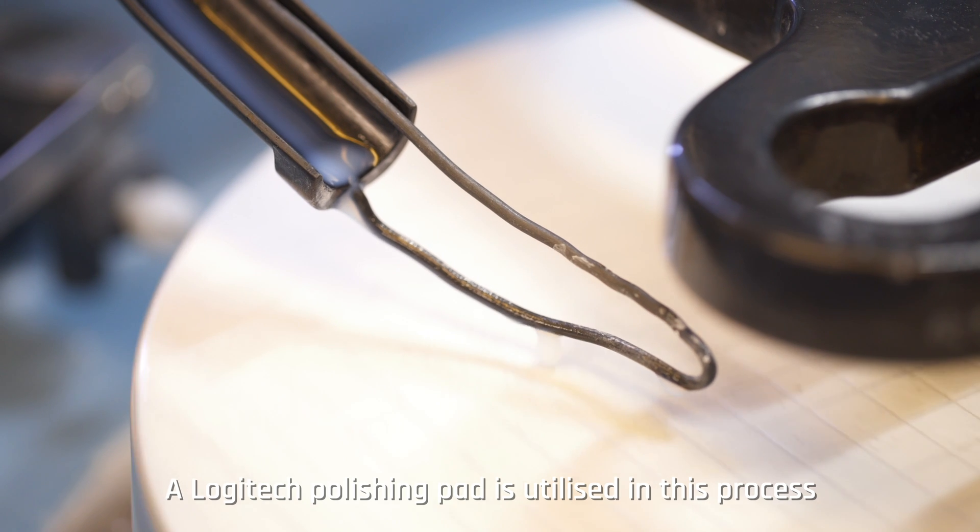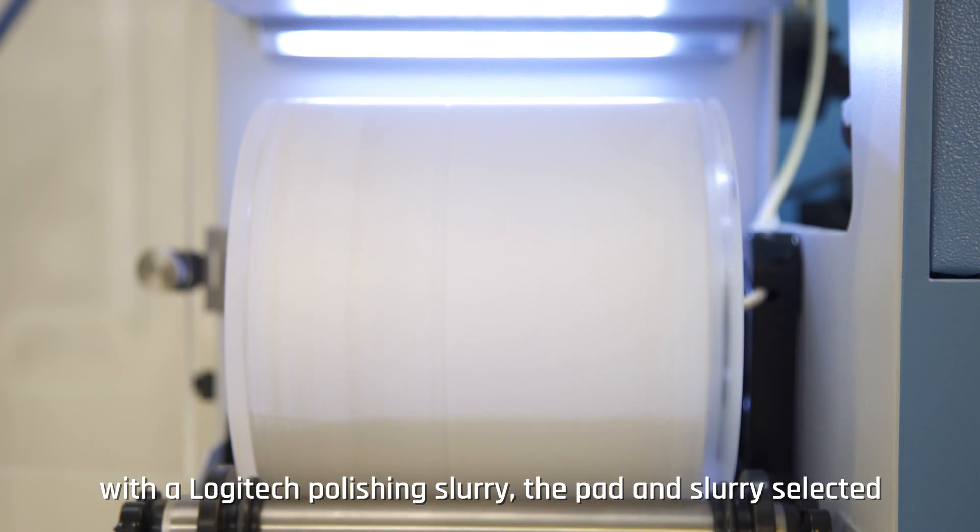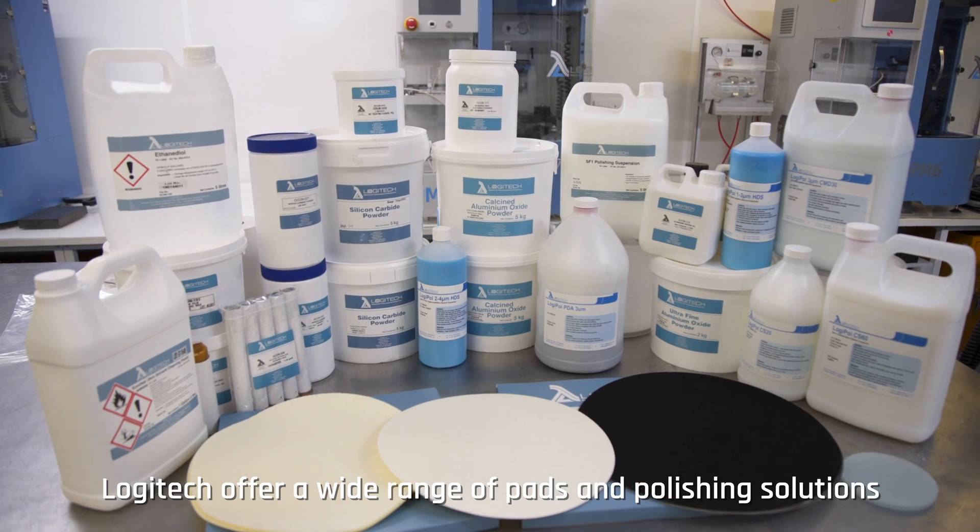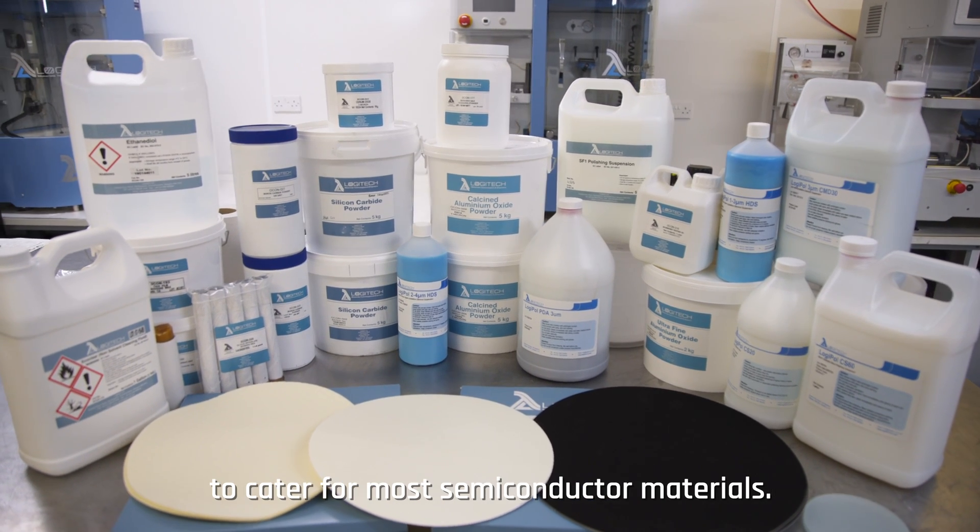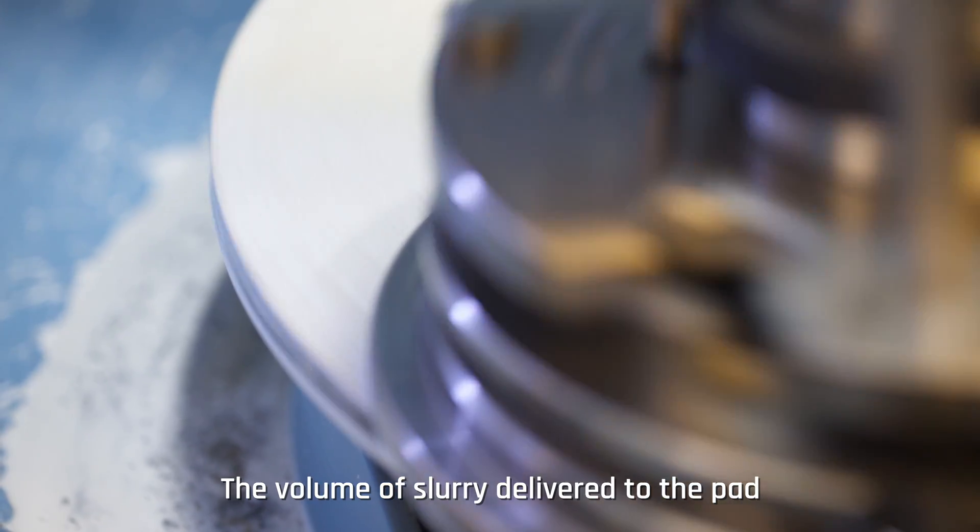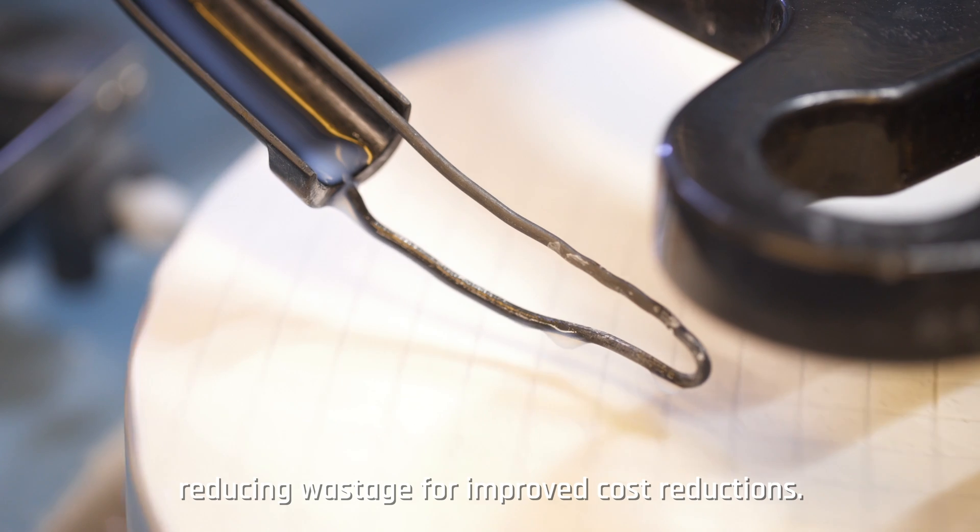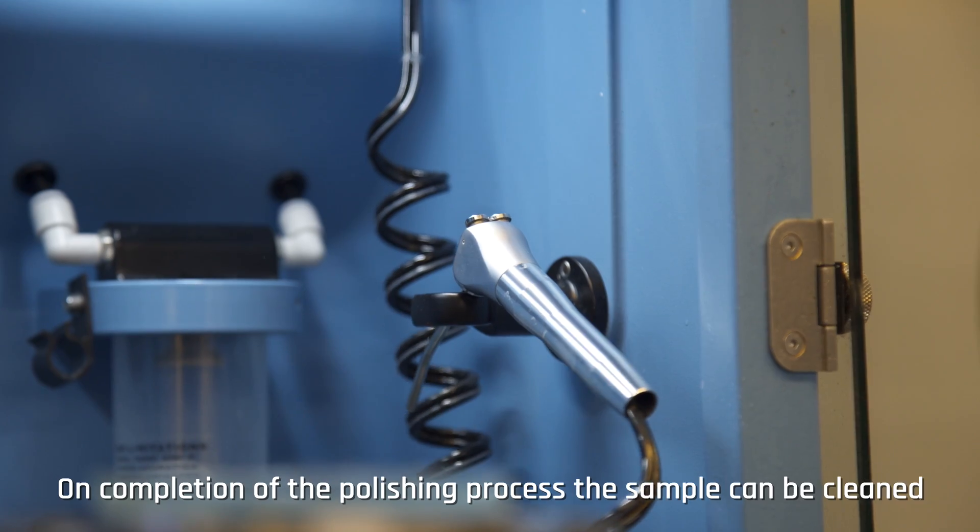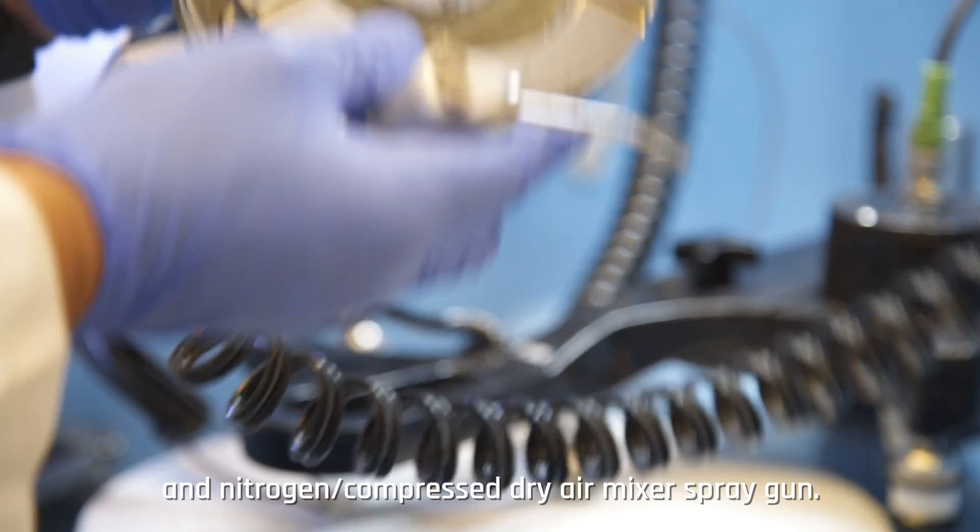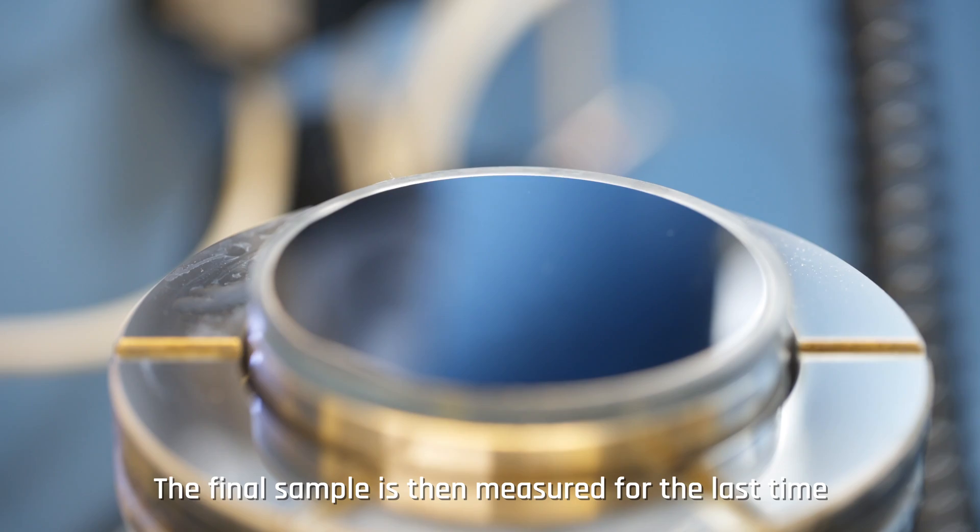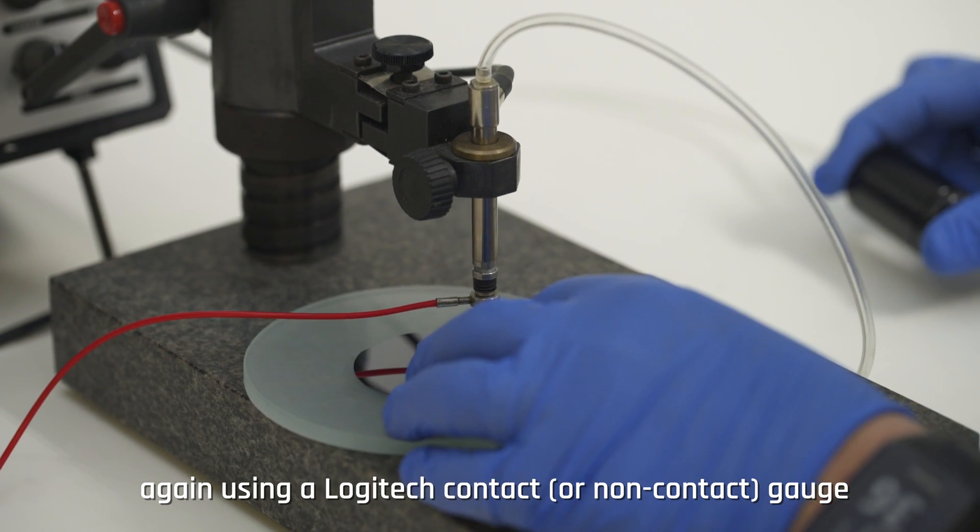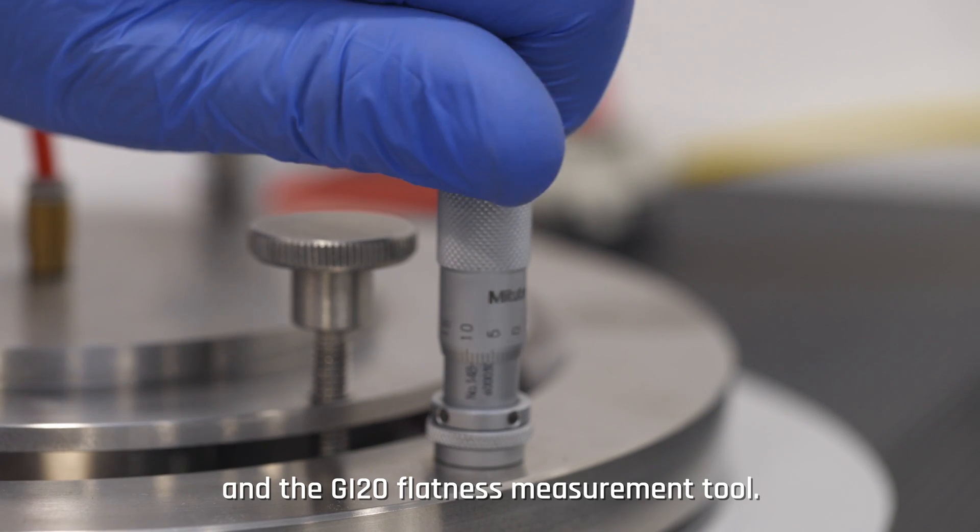A Logitech polishing pad is utilized in this process with a Logitech polishing slurry. The pad and slurry selected are dependent on the material being processed. Logitech offers a wide range of pads and polishing solutions to cater for most semiconductor materials. The volume of slurry delivered to the pad can be easily controlled via the GUI, reducing wastage for improved cost reductions. On completion of the polishing process, the sample can be cleaned in situ using the integrated deionized water and nitrogen compressed dry air mixer spray gun. The final sample is then measured for the last time again using a Logitech contact or non-contact gauge and the GI 20 flatness measurement tool.